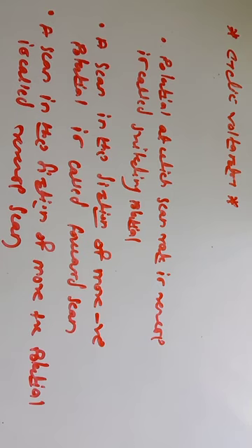So at least you should know forward scan, reverse scan, and switching potential. The potential at which the scan direction is reversed is called switching potential. A scan in the direction of more negative potential is called forward scan. A scan in the direction of more positive potential is called a reverse scan.